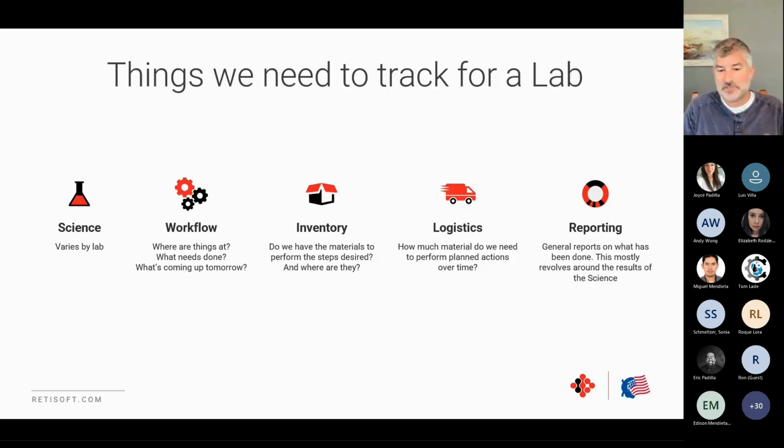So let's talk about logistics as an example. What volume of consumables do you normally use a month? What's the lead time on ordering? What's the planned consumption of those consumables during the current lead time or the next lead time? How much do you currently have on hand? You can just over order all the time, and that's an option, but it still doesn't mean you won't run out.